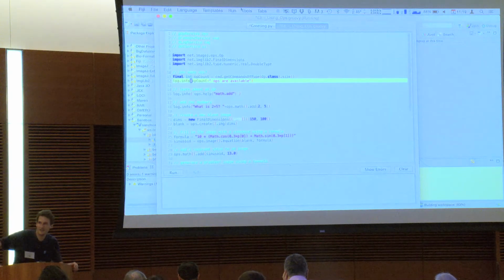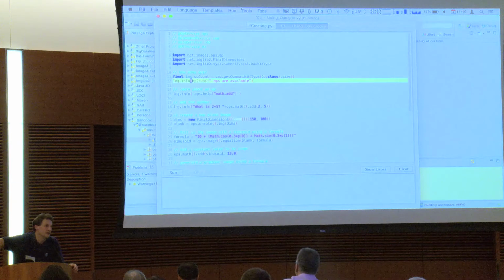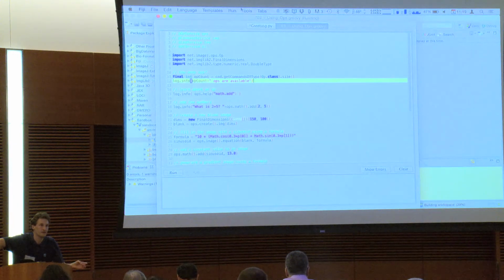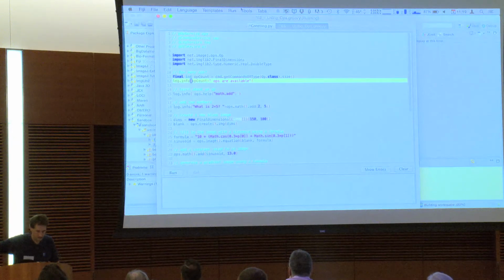So, Arya, that's fantastic that you can do that, but it should be control space. Yeah, I know Mark played with it. Maybe you guys can chat about it offline. I think it's great, but I don't think it's a substitute for having that big page that tells you what all the things are. And it also won't help you if someone else wrote an op and added it to ImageJ with an update site, then it's there, but it doesn't actually help you find it because this ops dot whatever won't have it built in.